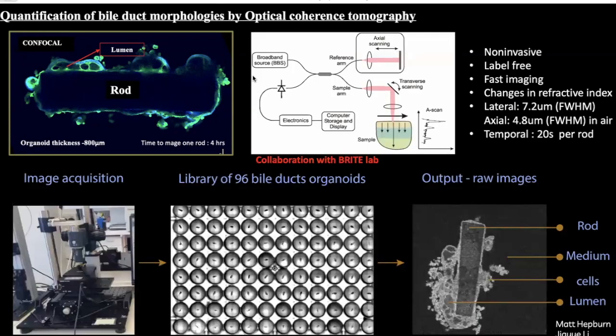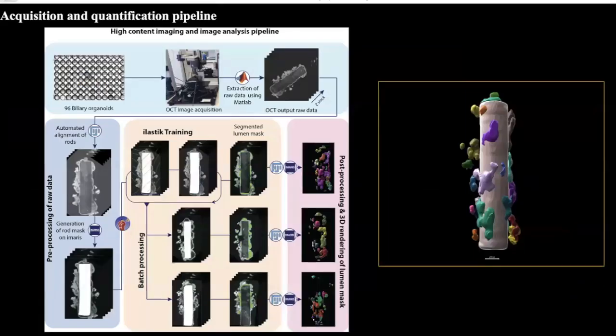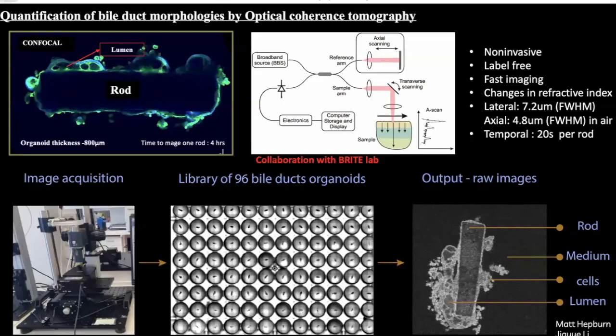So one idea that we had, in collaboration with Matt and Byrne in the Brit lab in Perth, was to use OCT. OCT is optical coherence tomography.